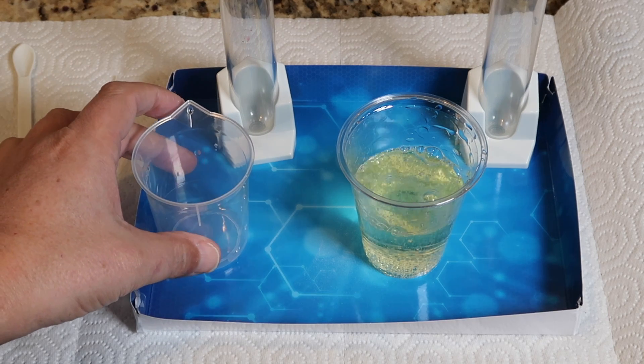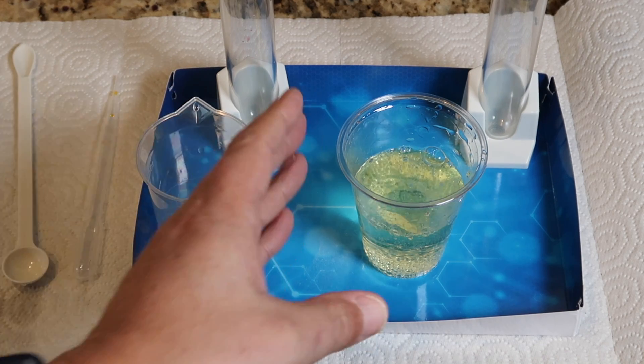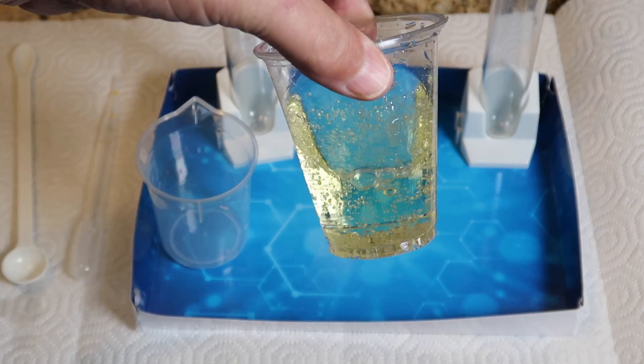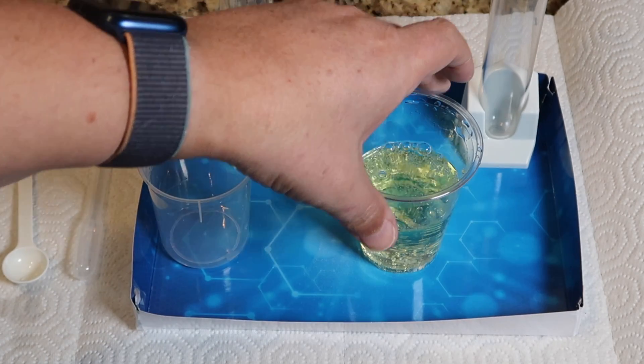And it is. Huge release of carbon dioxide gas there. And an atomic yellow solution. Good experiment.